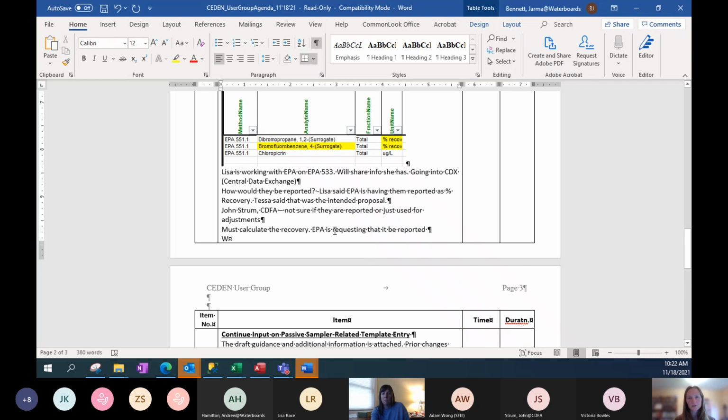And then there's a lab, the SGS AXYS lab in Canada, which I know a lot of people use for tissue and maybe some other things. Almost all of their methods are isotope dilution. So a lot of their methods include this.